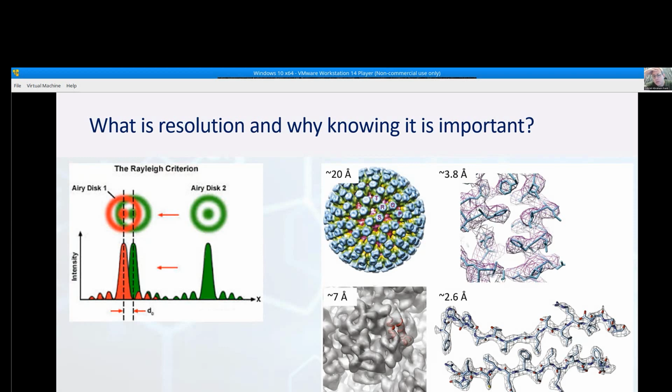However, there is a clear separation between instrumentation resolution limit and the sample. I can actually today with electron microscopy build electron microscopes that can reach a resolution that is subatomic. All the electronics, all the physics are set. We know how to do that. However, the sample is another source of losing resolution, and that is due to the limitation that the sample would not allow us to collect the data to the highest capability. That's a direct result of the fact that we would destroy it while we are collecting the data.